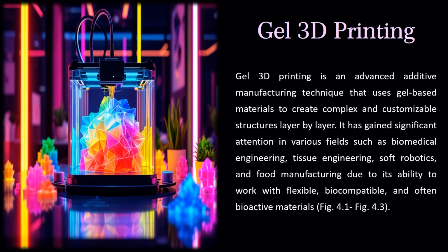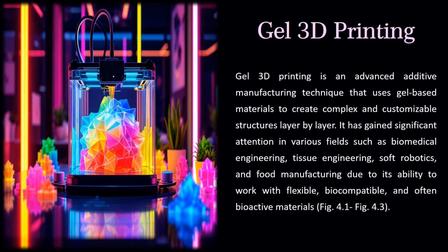This is also known as biogels or bio 3D printing. It has numerous applications, and it is considered one of the advanced additive manufacturing or 3D printing technologies. Here again, we are interested in making complex components, similar to our previous practice, in the form of layer by layer structures, and this has gained special attention of researchers, specifically in biomedical engineering. We are interested in using this in tissue engineering, in soft robotics, and in food manufacturing. One of the common reasons for these applications is the flexibility, biocompatibility and bioactivity of the gels that are commercially available.